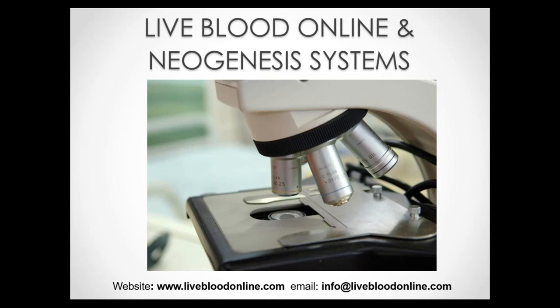Now, one of the earliest proponents of live blood analysis, Marcel Bessy, was a French hematologist who lectured at the University of Paris in the 1960s and 70s. He wrote a number of books describing the value of evaluating blood in a living, unchanged and non-stained state. He argued that all hematology labs should consider changing over from analyzing stained blood samples to live samples, mainly because with live samples you are able to observe in real time the dynamic processes of life at the cellular level. He said that you can capture events and sequences that are impossible to see in static, dead, and stained slides, and this is certainly something that we see in practice every day.